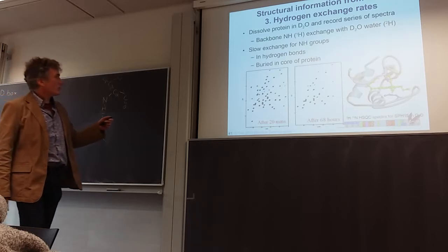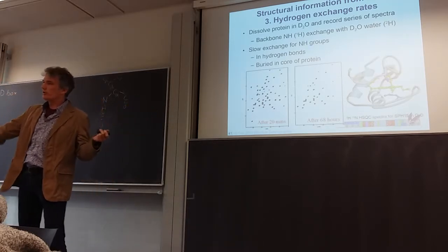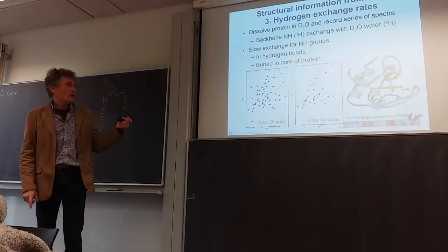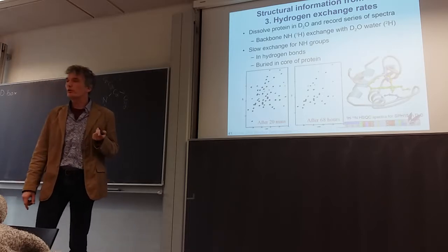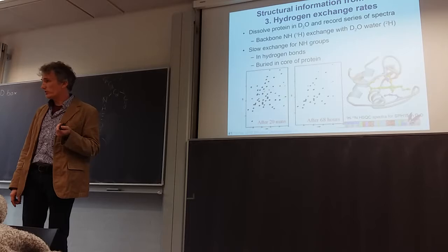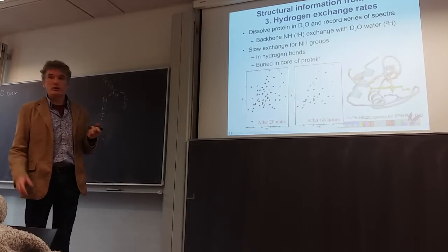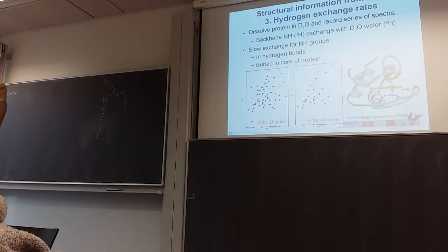Now the thing is, if you store the sample in the freezer, and you get it back out 3 days later, you put it in the NMR, you see much fewer peaks. And if you repeat it after 3 weeks, you see even fewer peaks. And then if you do it again after 3 months, you don't see any peaks anymore. But you can do the NOESY experiment to measure all the distances, and you still have a folded protein.